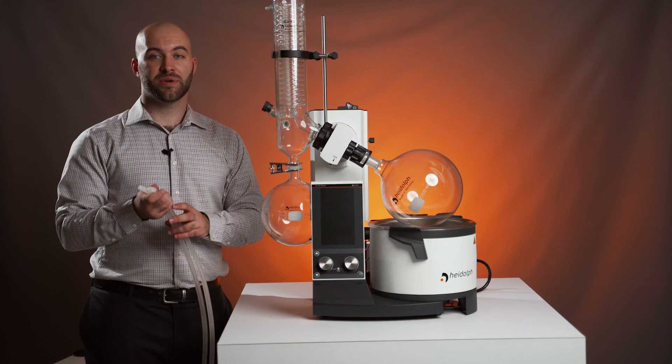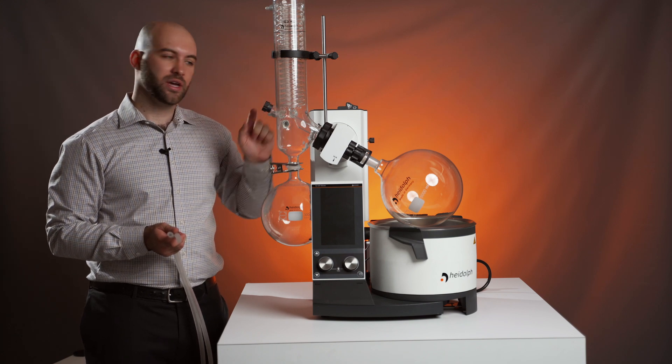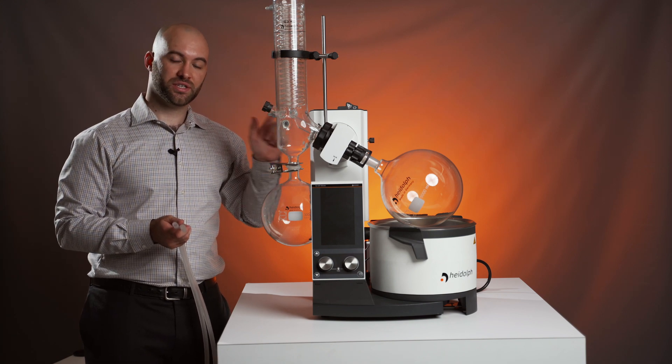Now we're going to attach the tubing that we just attached to our chiller to our condenser, and due to its dual coil design, it doesn't matter which of these two connections is in or out.